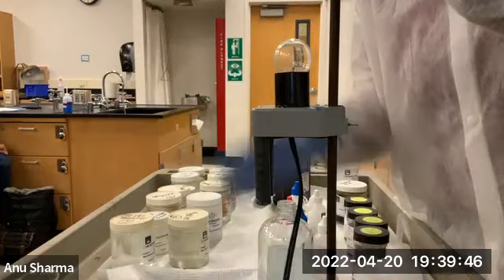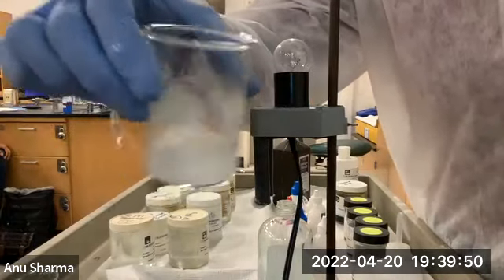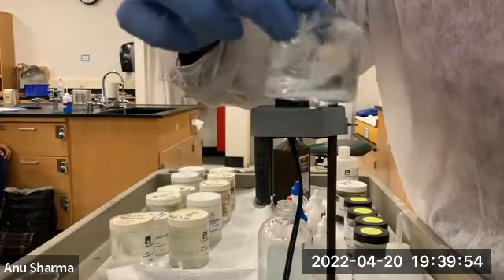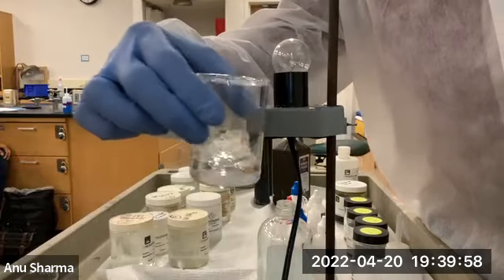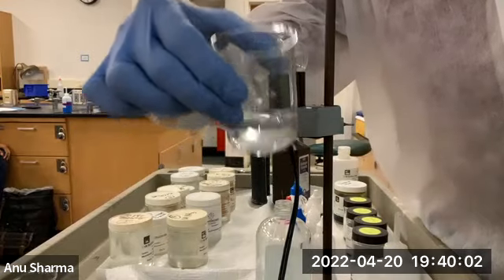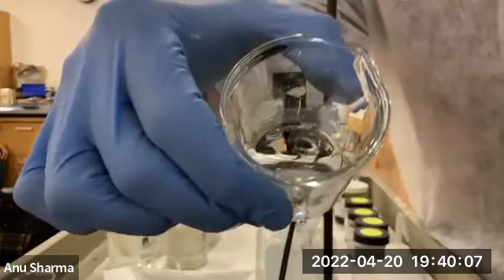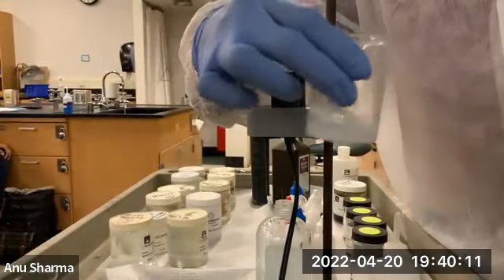Mix it like this. So it's dissolving. A little bit is left. Keep on doing it.